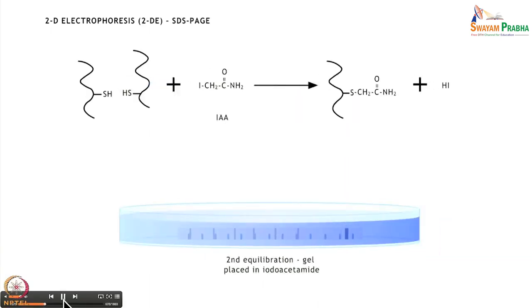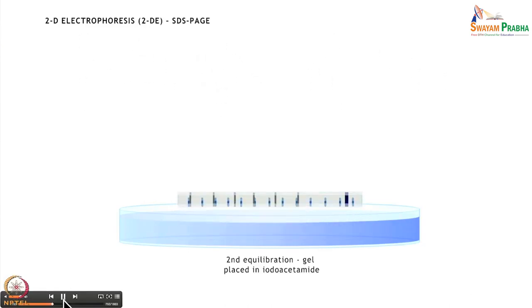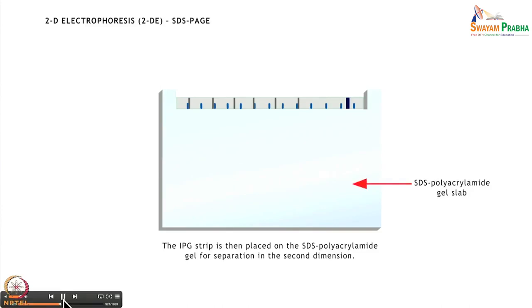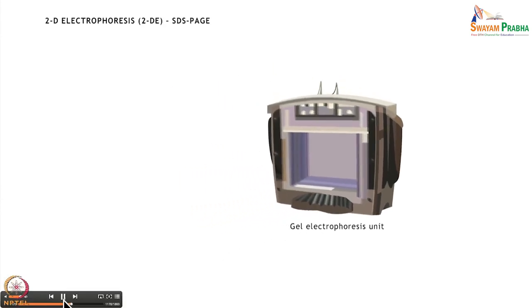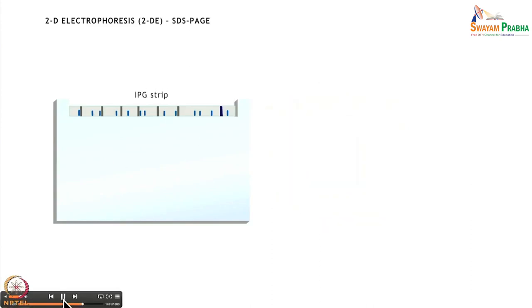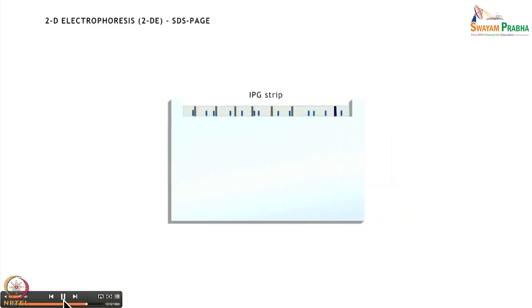This strip containing the separated proteins is then placed on the SDS polyacrylamide gel slab and subjected to SDS-PAGE by applying a direct current between 100 to 350 volts, depending upon the size of the gel. Any proteins that may have been present as a single band on the IPG strip due to similar isoelectric points can now be separated on the basis of their molecular weight, with smaller proteins migrating farthest.